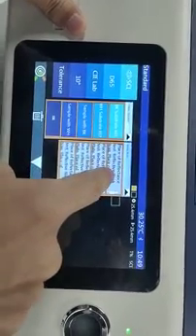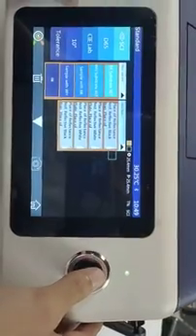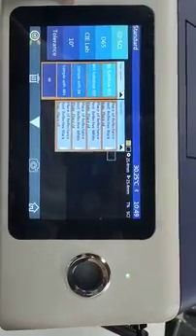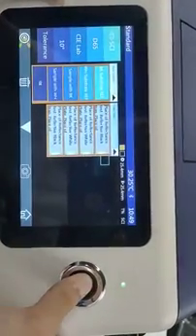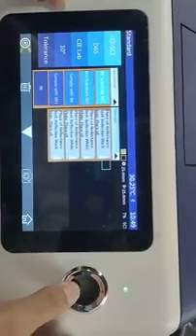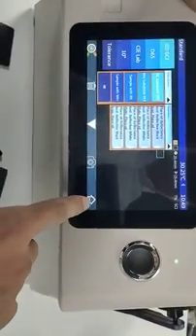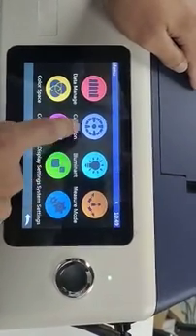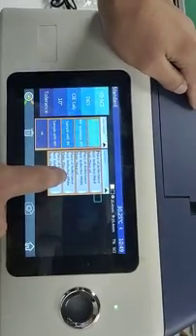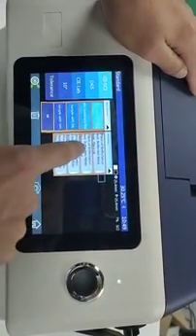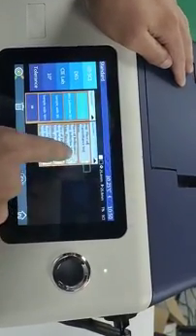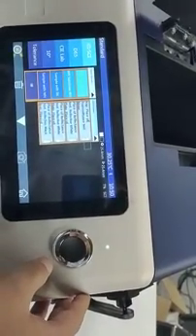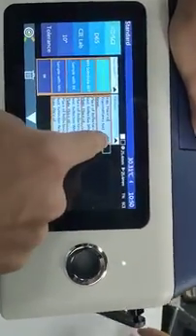This is the interface for measuring haze. All of this. First, please reflectance test. Yeah. It needs to use. Yeah, it needs a recalibration. Pay attention to the parameter here.